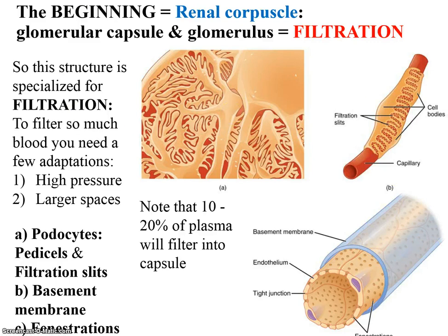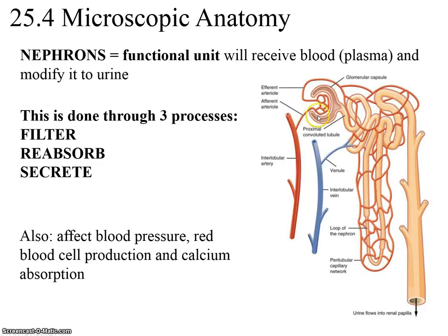All right, so this renal corpuscle, now we're really zooming in to see its features and structures. The corpuscle, which is the capsule, and the capillary bed called the glomerulus, do filtration, right? So here's a low magnification, and here's our capillary glomerulus if we straighten it out. And sitting on top of it is one of the walls of the capsule. Remember, the capsule is a cup, so we're looking at this inner wall here.